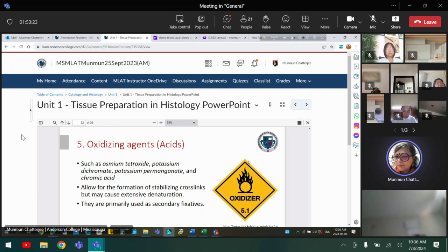Sometimes if you have to do any ion measurement and you don't have disposable pipettes, you have to wash them. So potassium dichromate is very good. Not the strong one, but you make a dilute potassium dichromate solution and dip everything in it: glasswares, pipettes. You can leave them there for 24 or 48 hours and then wash in running water and clean them.